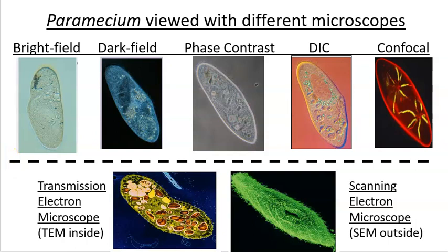And so I wanted to show people these different types of microscopes that are out there, where we can just change the setup around to improve our contrast, change our magnification that we can use, and also get that resolution to see those structures and also to see those cells.